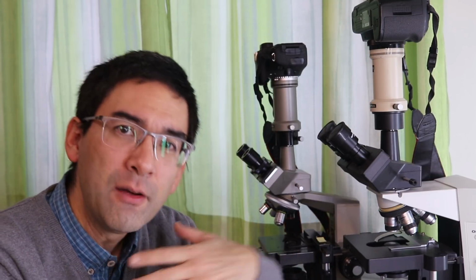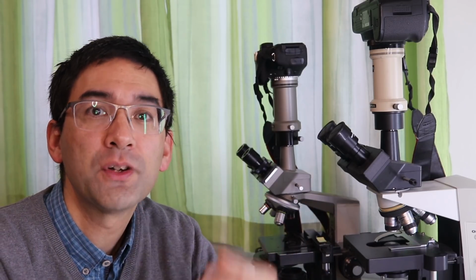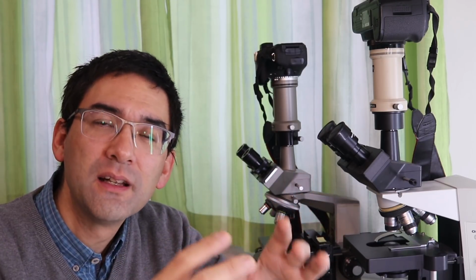But if I were to buy myself a second set of eyepieces, then I would probably not buy eyepieces with a higher magnification, but rather one with a lower magnification, like for example 5 times. The reason is that then I can also place larger objects under the microscope and can still look at the whole object at a lower magnification.